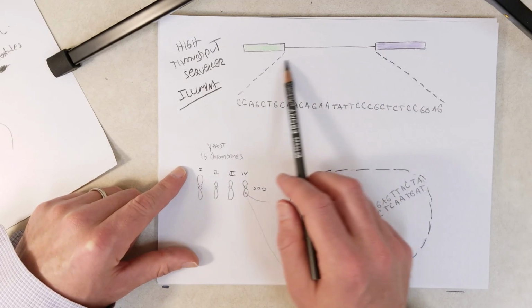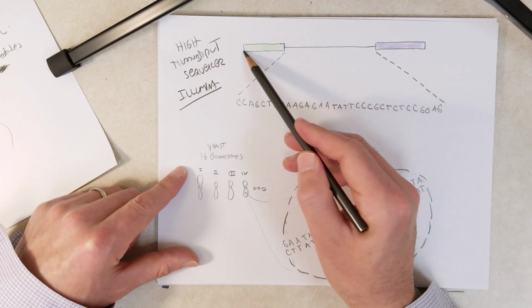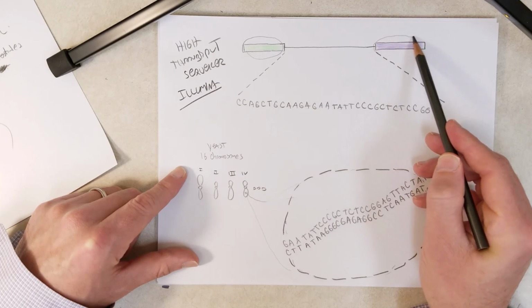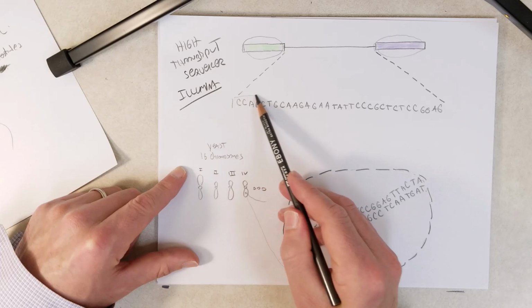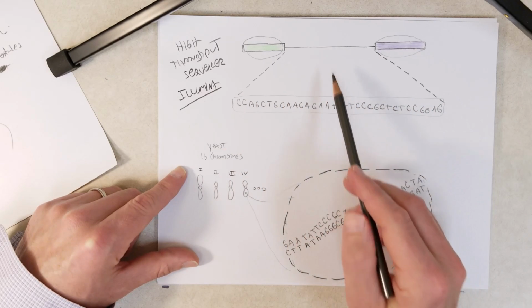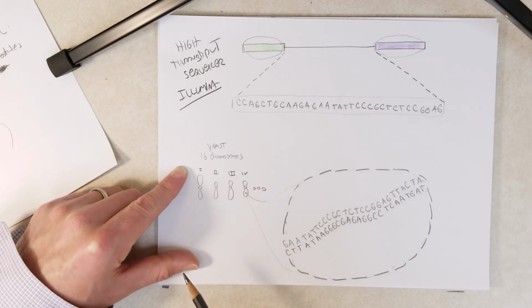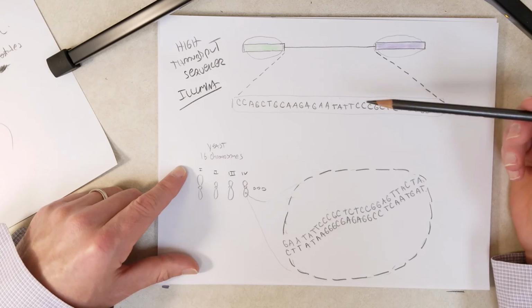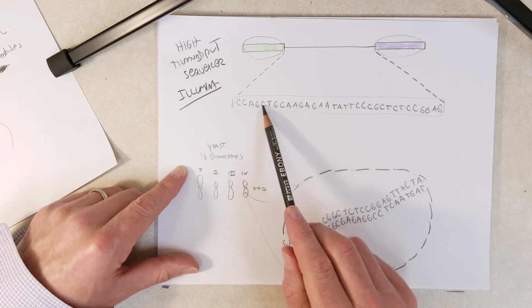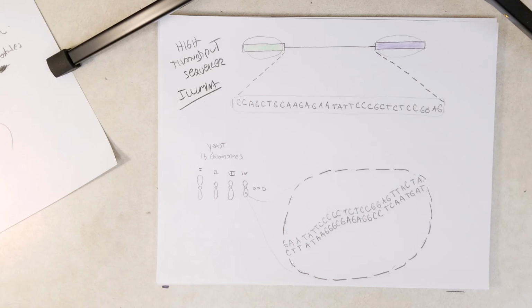And so we can sequence all of these molecules here, and then we can use computers to remove any sequences that match this green adapter and this purple adapter. And then we're left with millions of sequences, each one corresponding to the DNA between a green adapter and a purple adapter of a DNA molecule. And so what would we do then? Well, I'm going to just focus in on one of these. So this is an example sequence that might be found between a green adapter and a purple adapter.